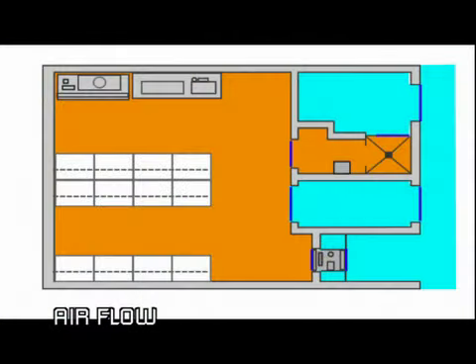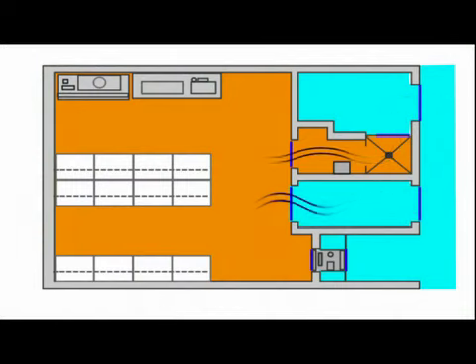The requirements for heating, ventilation, and air handling can vary depending on the transmissibility of the pathogen that will be handled in the lab. As a general rule, the air in a facility should always flow inward toward the area of higher containment. This is referred to as inward directional airflow. This smoke pencil is one of the tools which can be used in the commissioning and certification of a containment laboratory to verify the integrity of the containment room. It clearly shows the direction of airflow.